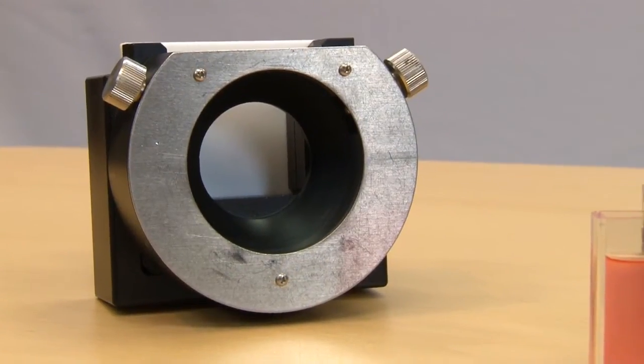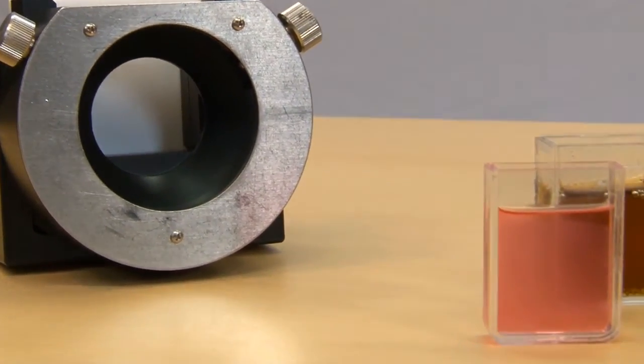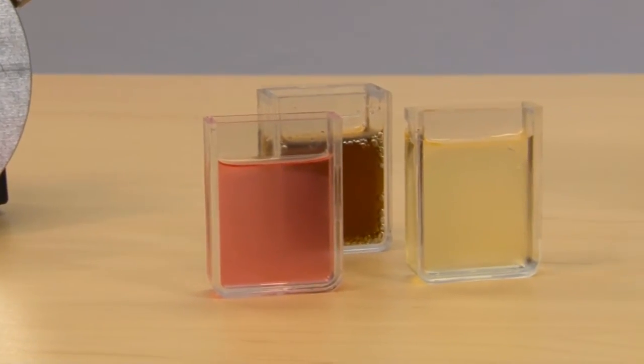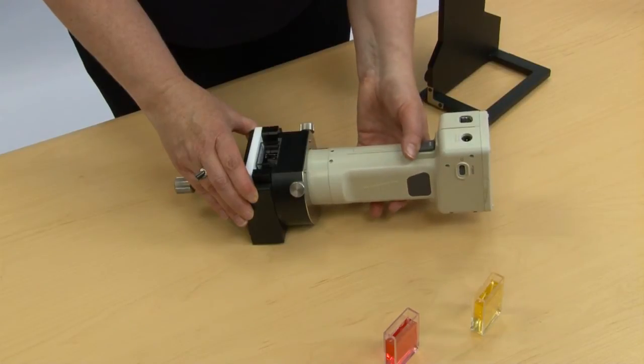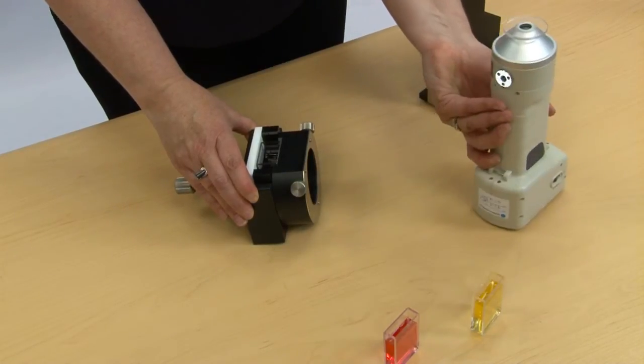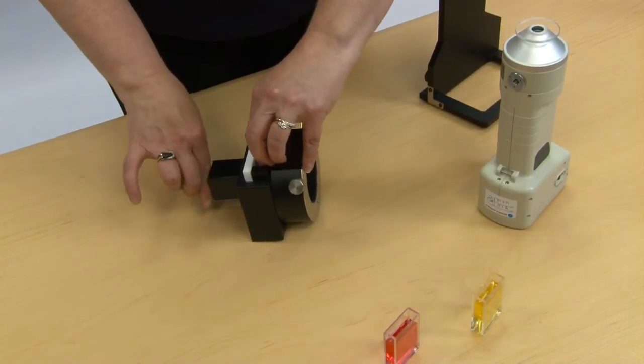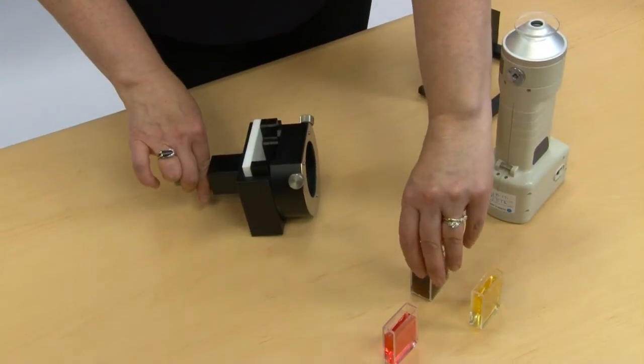The CR400 cell holder allows transmittance, reflectance measurement of liquid, and accepts a 10mm or a 20mm cuvette. It enables the relative reading of liquid using a CR400 colorimeter. This does not provide the user with percent transmittance data.